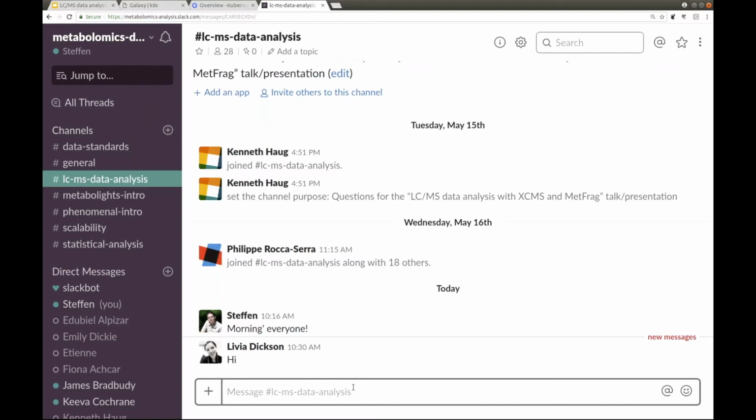Okay, so obviously MetFrag uses LC-MS/MS, but for the LC-MS and CAMERA steps, can you do that with LC-MS data? Yeah, that's plain LC-MS and relies on the MS1 information only. So you could run that workflow on LC-MS data and simply skip the MS/MS parts. And then this will actually feed towards the statistics workflows that we're going to see later.